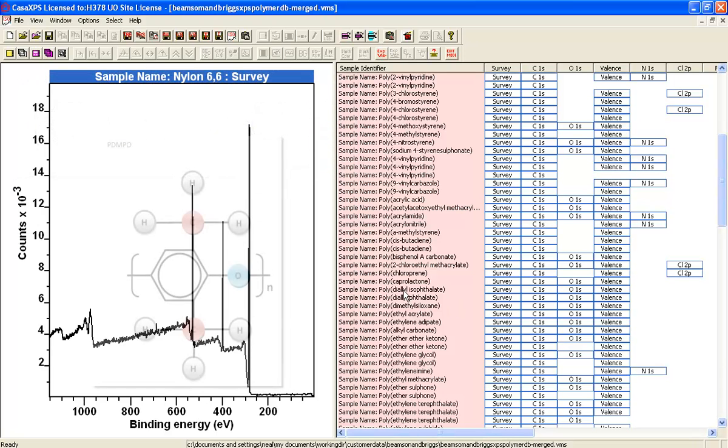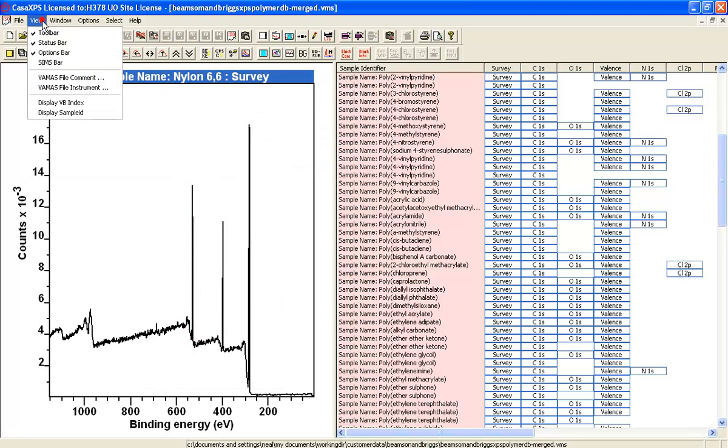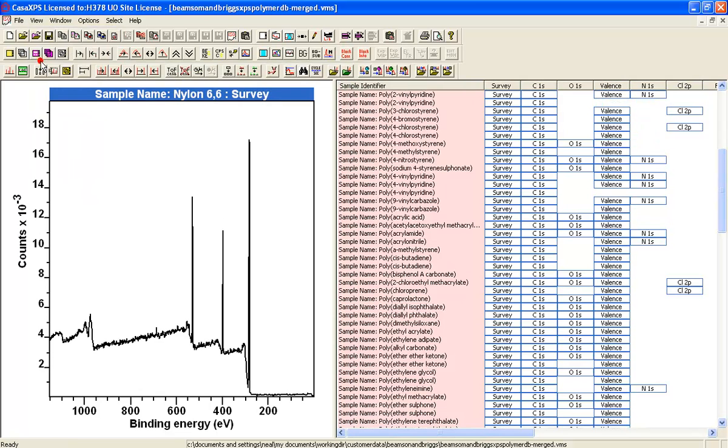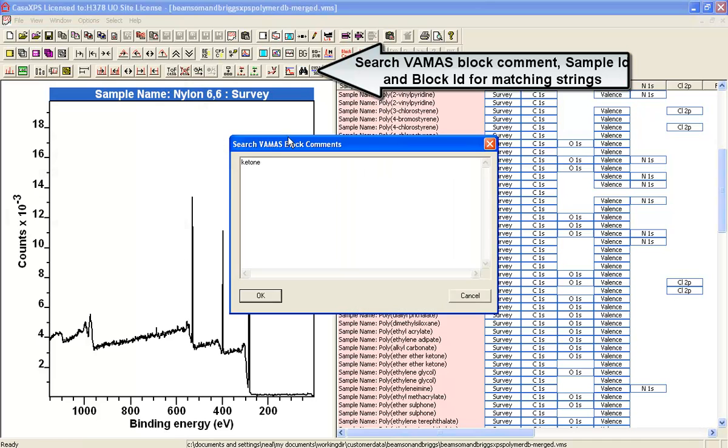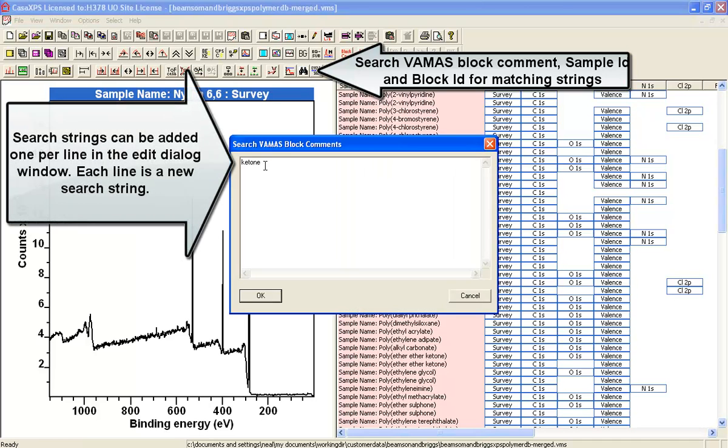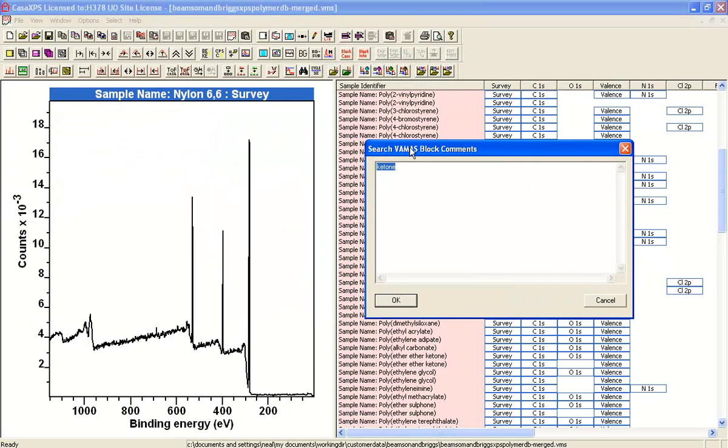Alternatively, if I select the SIMS toolbar here we have a search item. So when I search I can search for a string and I believe that I want to find PEEK so I'm going to search for ketone.